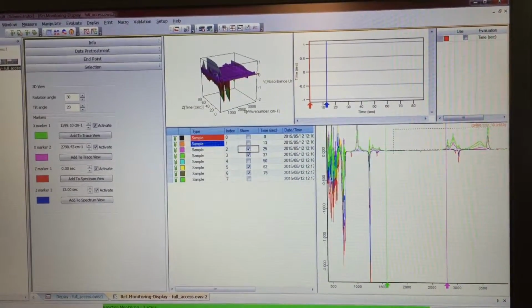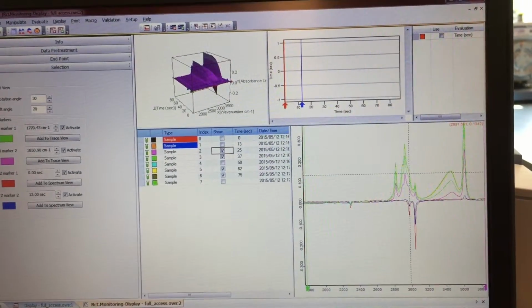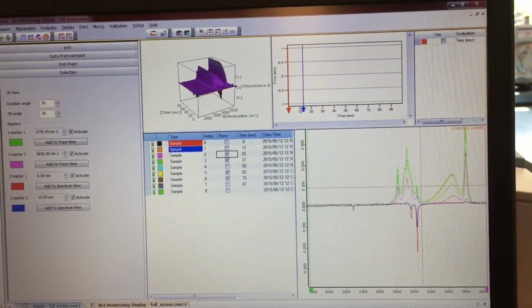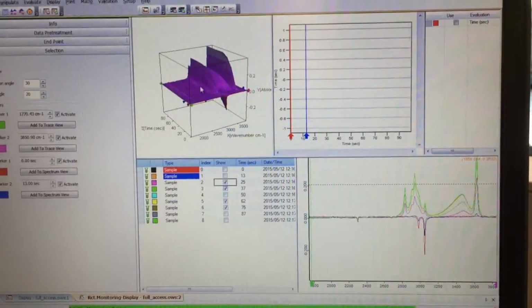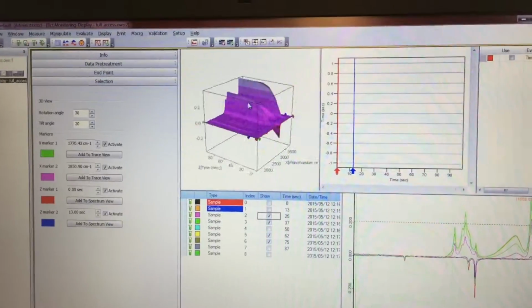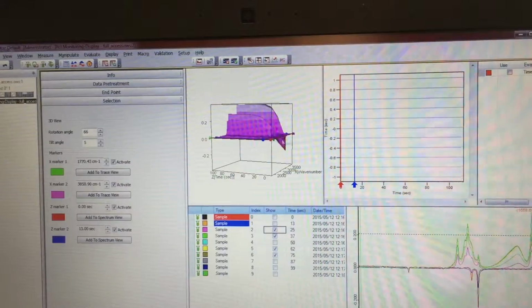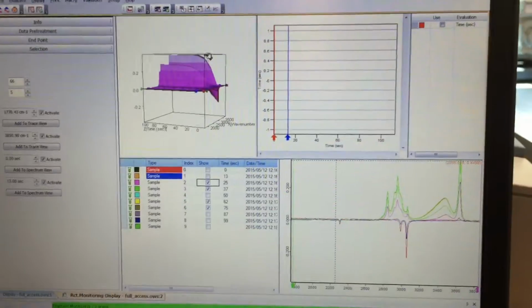So we're expecting an alcohol. So OH has a broad region here. Let's see what's going on. What I really like about the 3D plot is we can click and drag it. It is showing the region that I zoomed in on this plot. It is showing me zoomed in here.